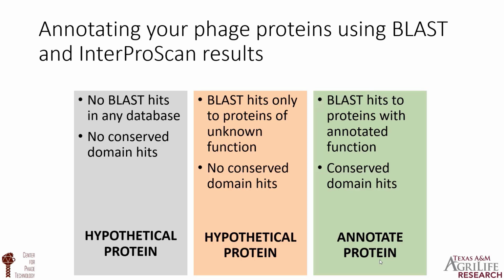NCBI is no longer recommending a distinction between hypothetical novel and hypothetical conserved proteins because that status can change when the database is updated. If you have BLAST hits to proteins with annotated function that you believe, or conserved domain hits that you can interpret, then you can annotate that protein with the appropriate function.